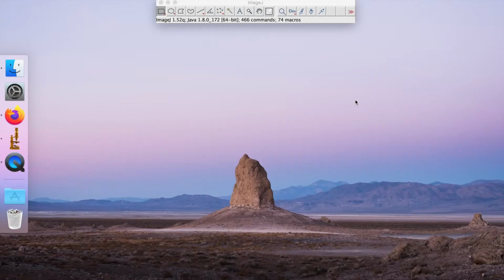Hi there, this is Grant Snitker, and this is tutorial video number 2 for CharTool. In this video, I'm going to go through everything you need to do in order to set up a video microscope, set the scale, and essentially get all prepared for quantifying some charcoal using CharTool.